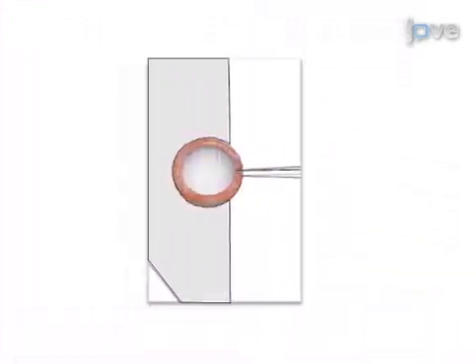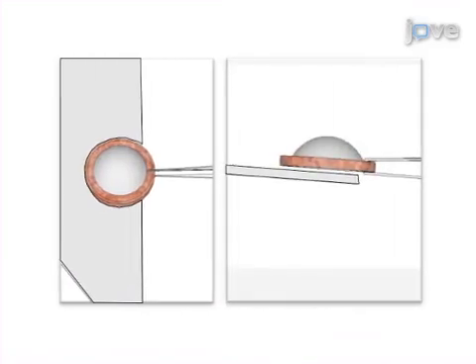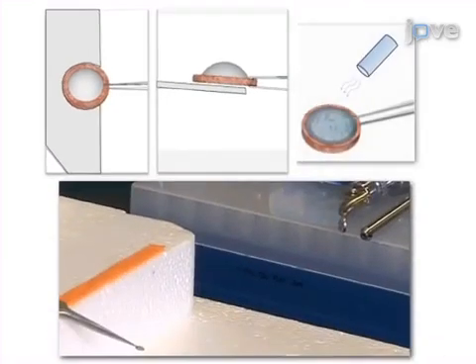The final step is to remove the excess solution by blotting from the backside of the EM grid, and then gently drying under nitrogen gas.